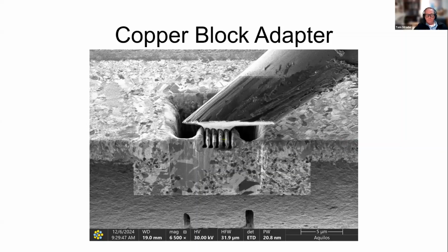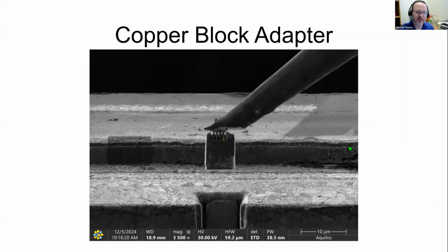Okay, great. So now that I've attached my copper block, I'm going to cut it out and then lift it out. And I'm going to use this later on. This can be done a day ahead of time, so you don't need to do this the day of.